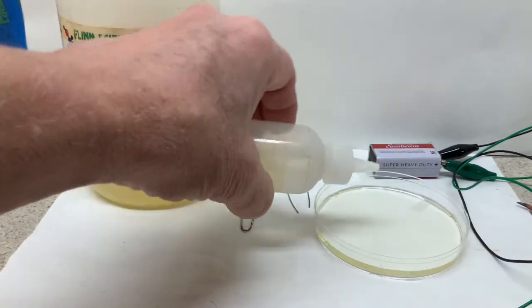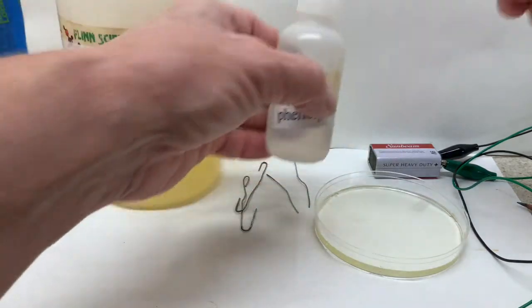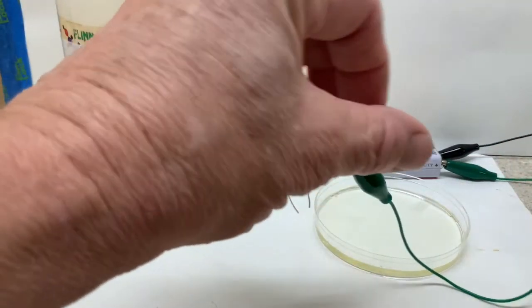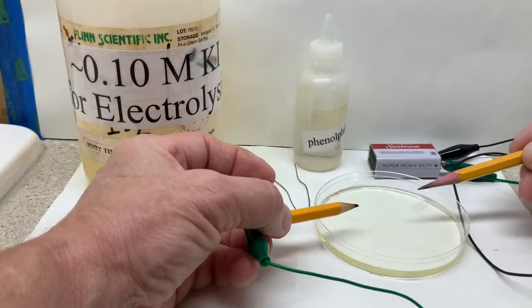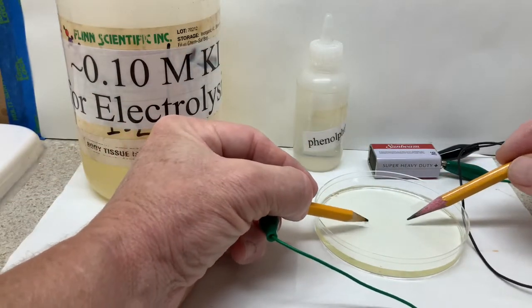Phenolphthalein, which you know is an acid-base indicator, is added. And the electrodes are placed into the solution. Now it's time to make some careful observations.